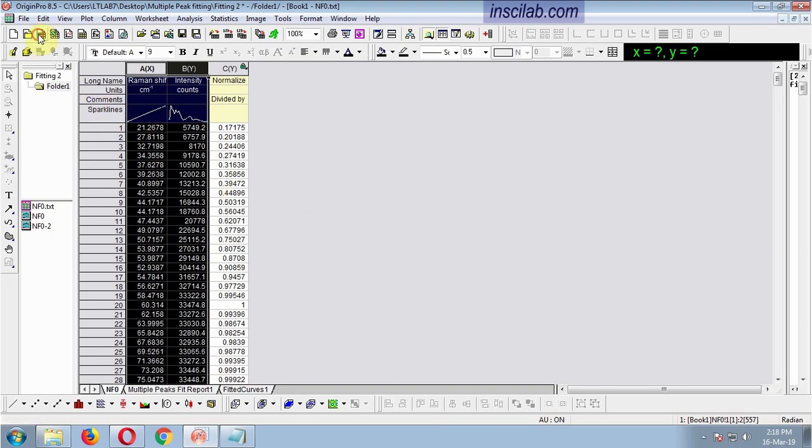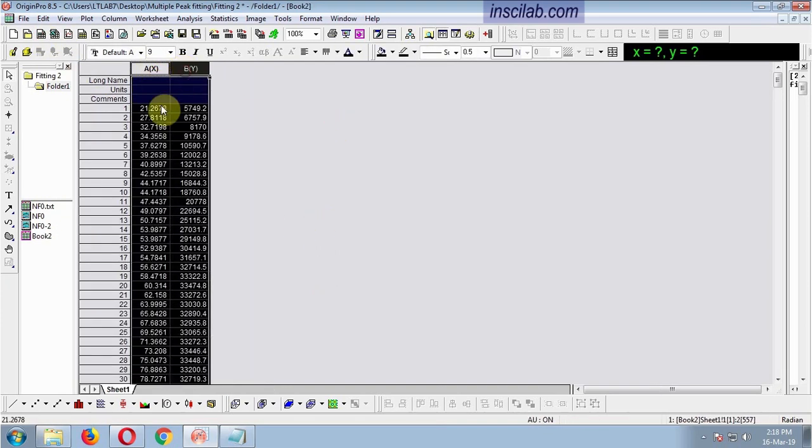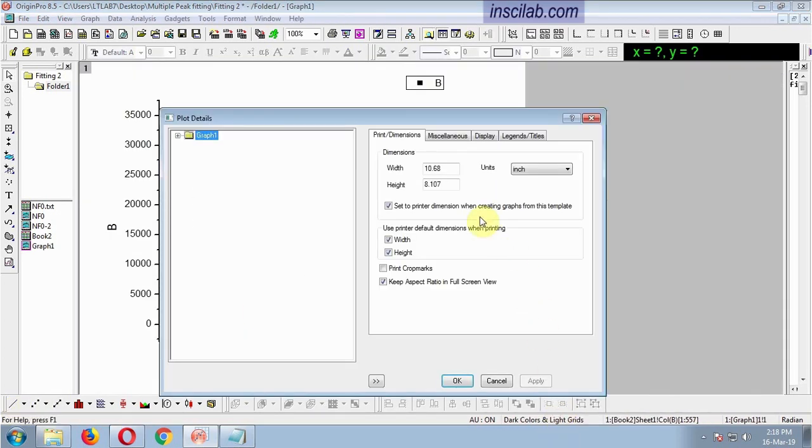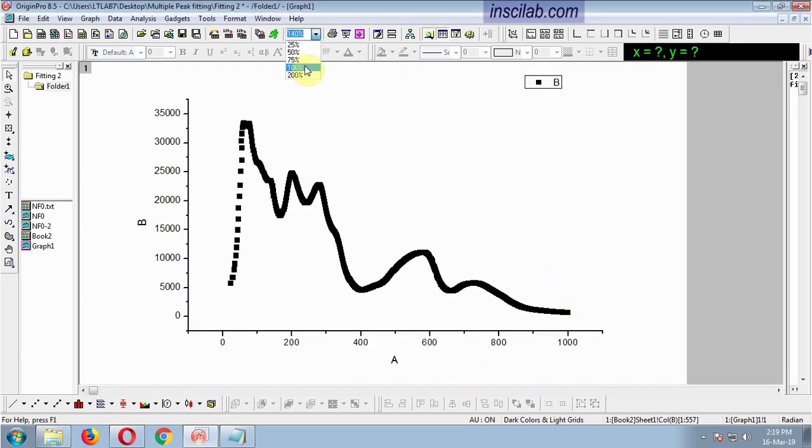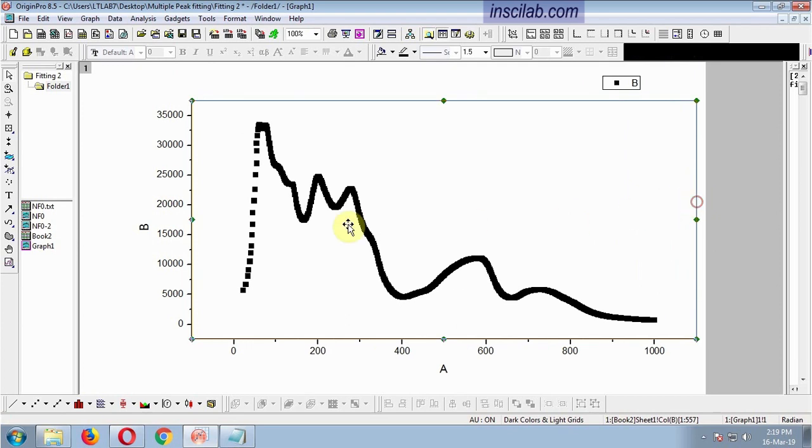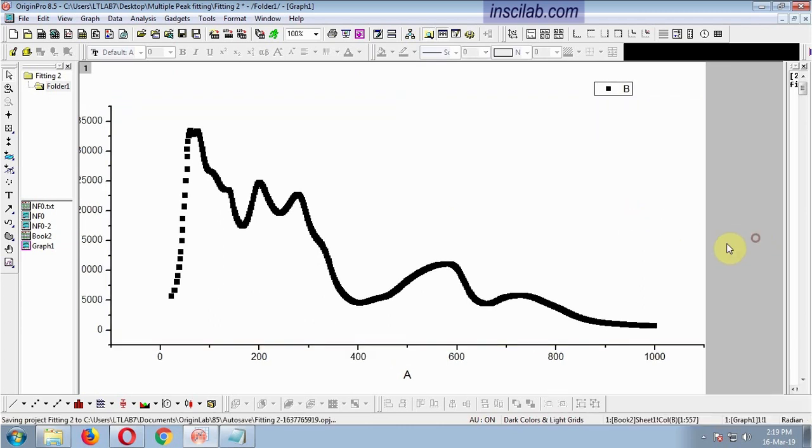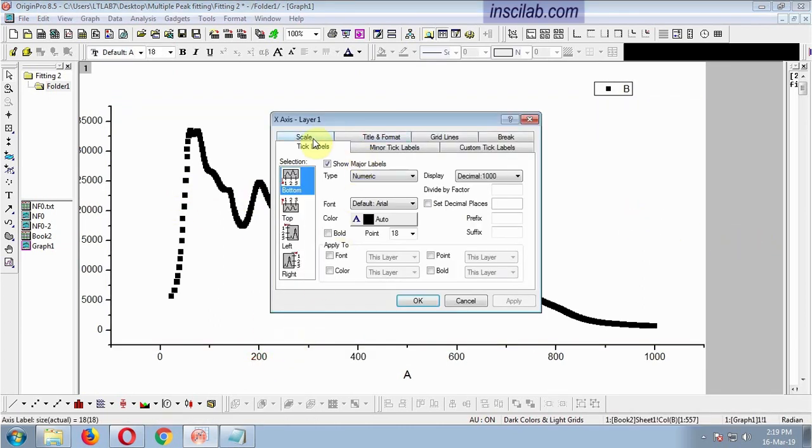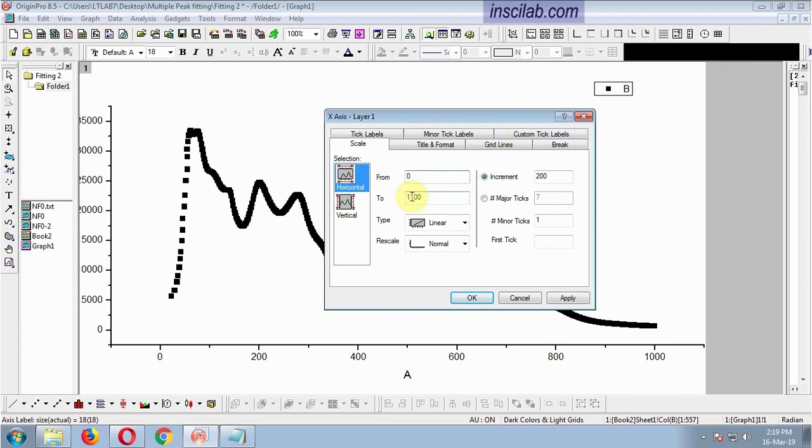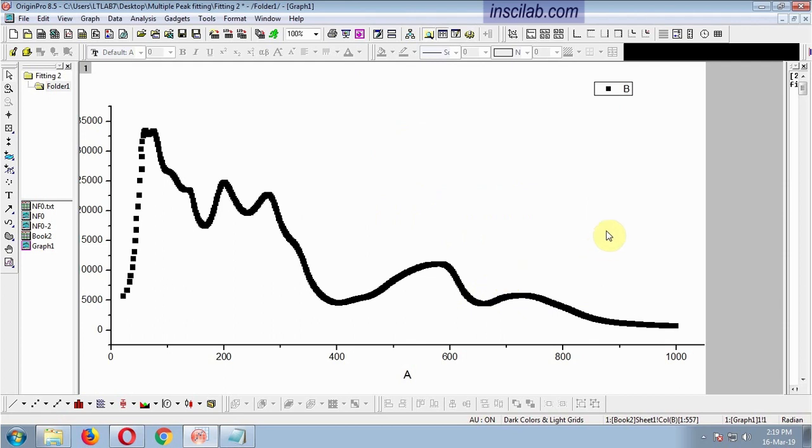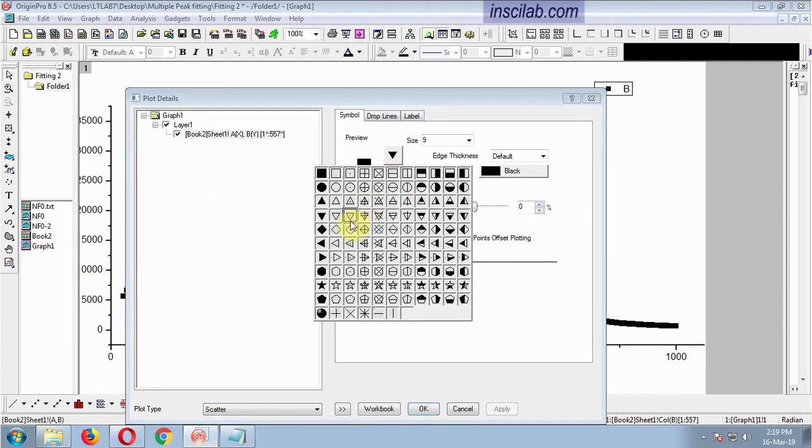I am taking data to a new workbook. Plot the data in scatter type. For better visibility, adjust the dimensions. Adjust the scale. Change the symbol to open circle.